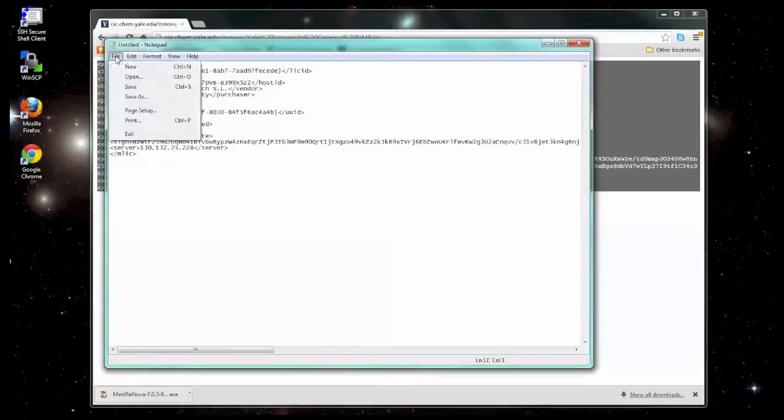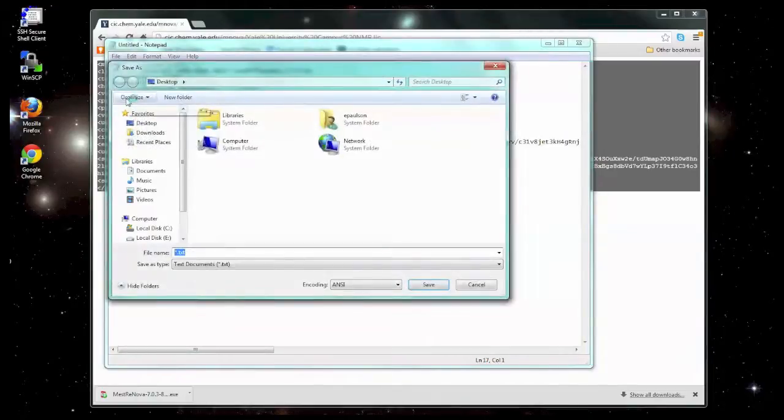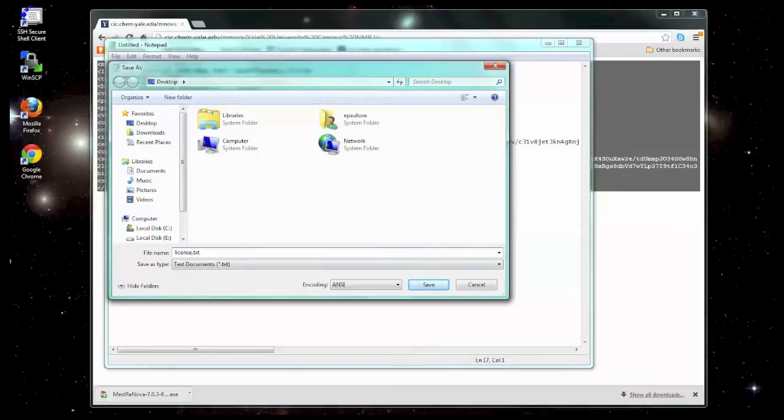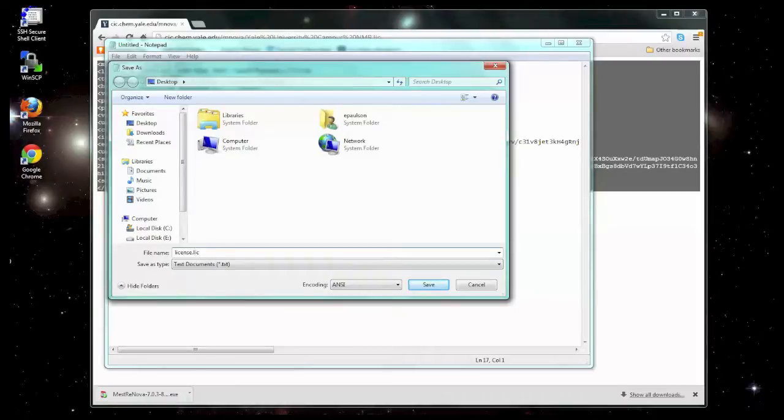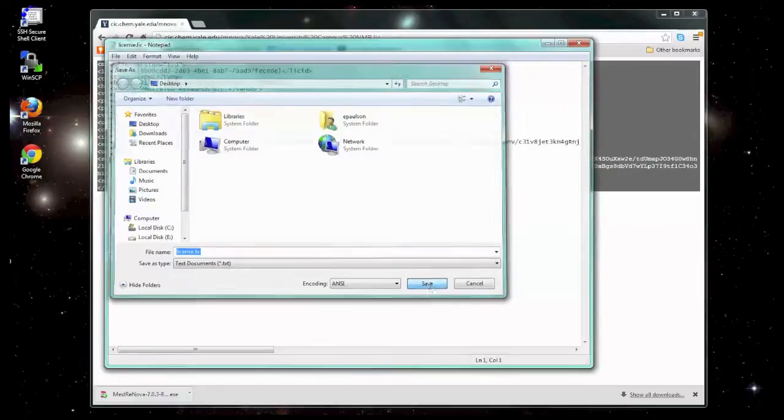Then select File, Save As. You can name it anything you want, but make sure you save it in a location that you can find later and with a name that you'll recognize later. It will help you if you change the extension from TXT to LIC. It will be easier to find later on once you are doing the activation process. Go ahead and save it.